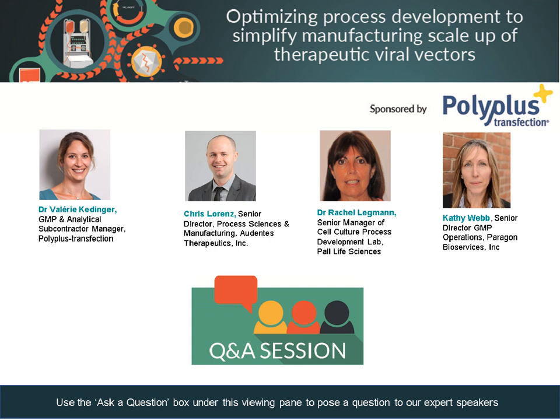Yeah, absolutely. Great. And so what factors inform the decision of which culture system to use, adherent versus suspension? Kathy, if we come to you on this one first. Sure. Being a contract manufacturer, we obviously work very closely with our clients, and there are some things that they come to us with right away in terms of their program. One of the things that they might already have a strong inclination for is where they're sourcing their cell line and if it's adherent or suspension. So we work with them to define basically the cell line and system that they're looking at.